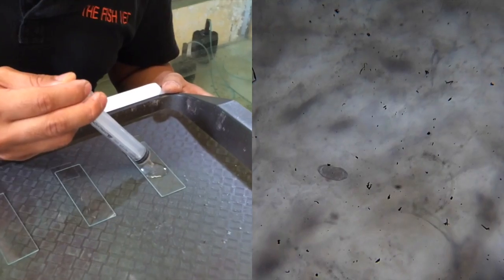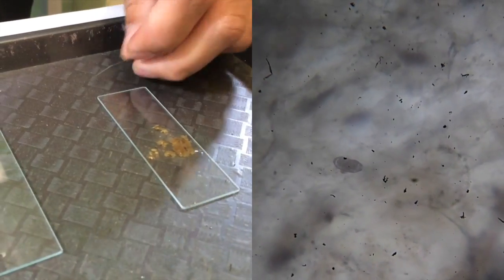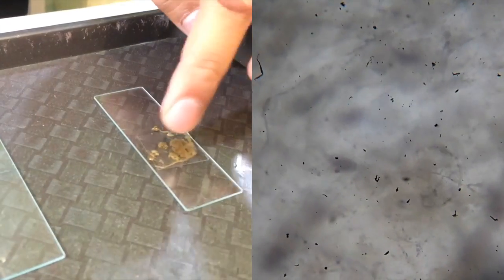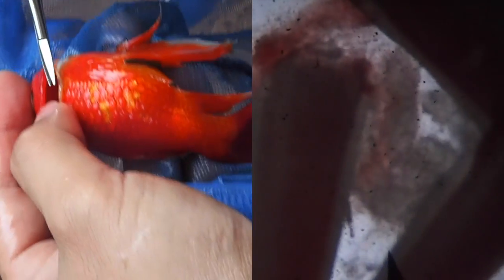Now we're looking at fecal samples from a cichlid. We've got oval-shaped eggs belonging to the Capillaria intestinal nematode worm. Focusing in and out of the plane reveals there are more eggs — we can see at least three eggs here. Now we're looking at gills from a goldfish, and you can see worms on them known as gill flukes. Their scientific name is Dactylogyrus, viewed here at 4x magnification.